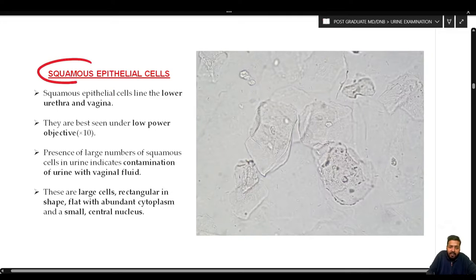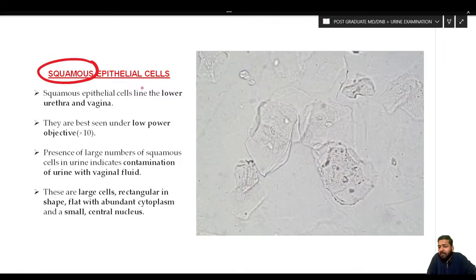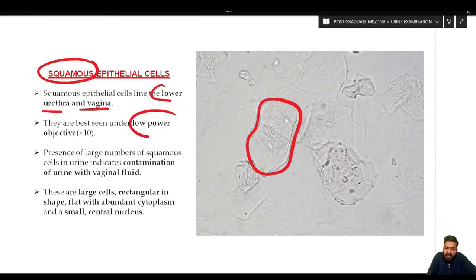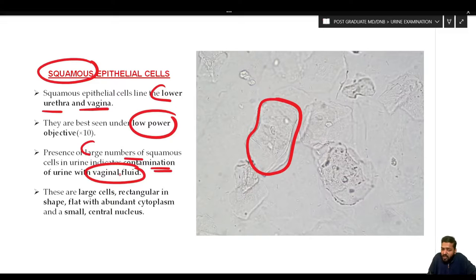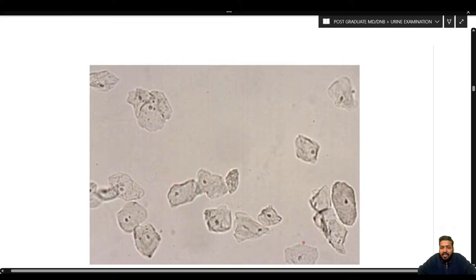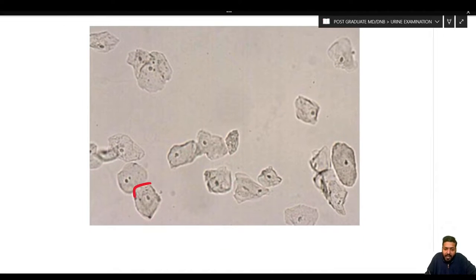Squamous epithelial cells are the largest of all epithelial cells encountered in urine. They line the lower urethra and vagina and are best seen under the low power objective. They are large, flat, rectangular cells with abundant cytoplasm containing a central small nucleus. The presence of large numbers of squamous cells is indicative of contamination of urine with vaginal fluid.